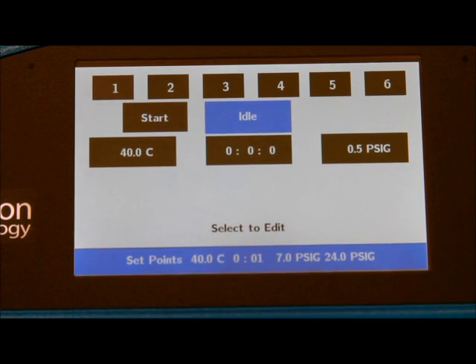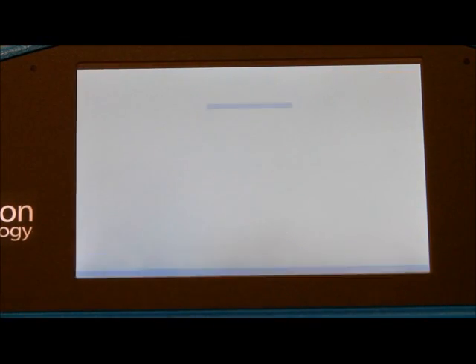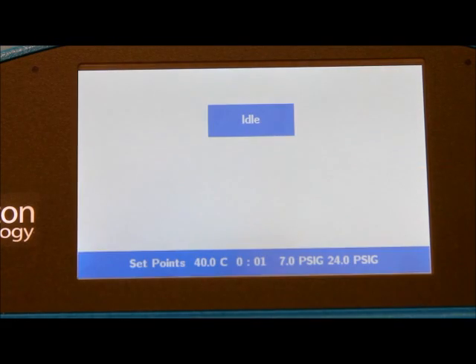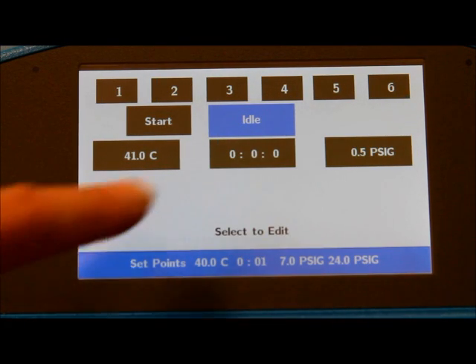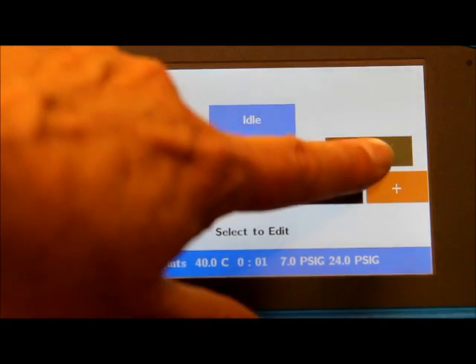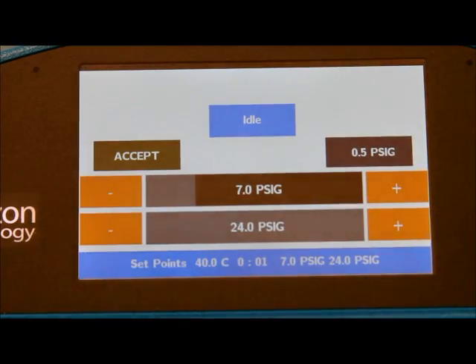The software is very easy to program and basically you have three settings. The temperature of the bath — you can set that dependent upon the solvent that you're evaporating; 40 to 50 degrees would be typical for dichloromethane. The time for evaporation — in this case we have one minute set because we want to see the end. And the pressure for the gas flow, which ranges from 2 to 24 psig.